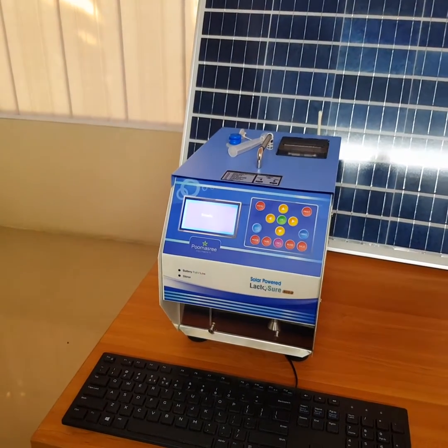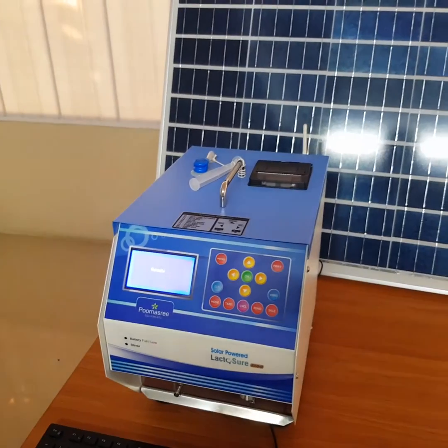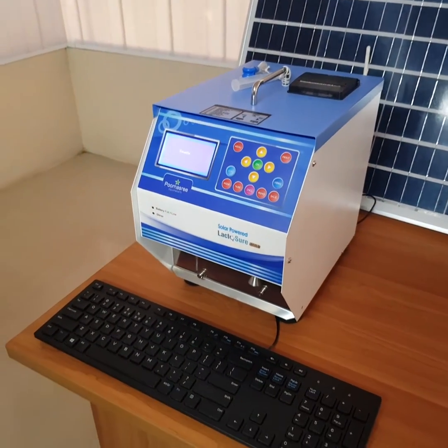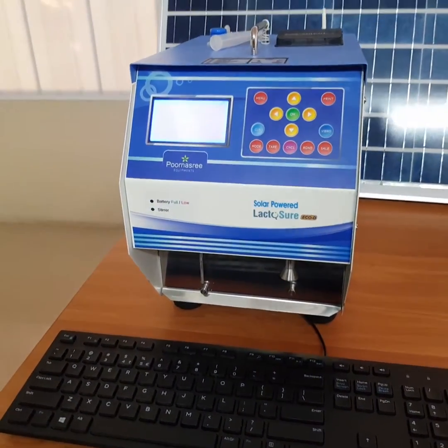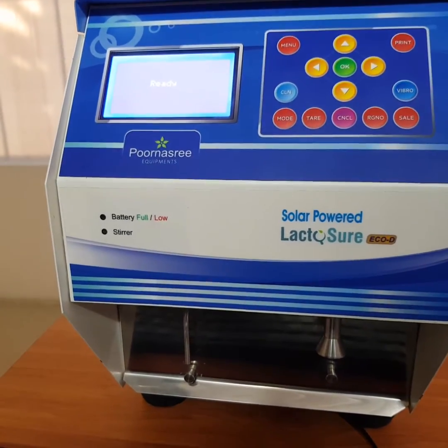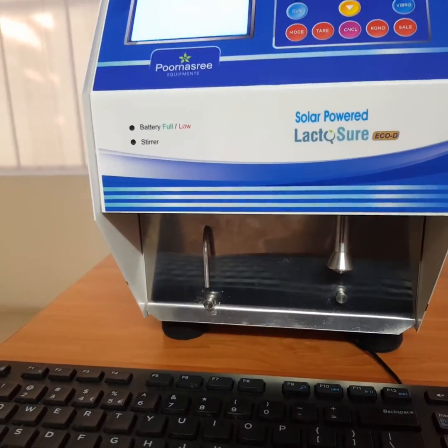LaktoShare EcoDS has an inbuilt DPU, stirrer, thermal printer, and GPRS connectivity. It also has an inbuilt lithium battery which can be charged using a solar panel or power adapter. GSM and RFID are also available as optional features.